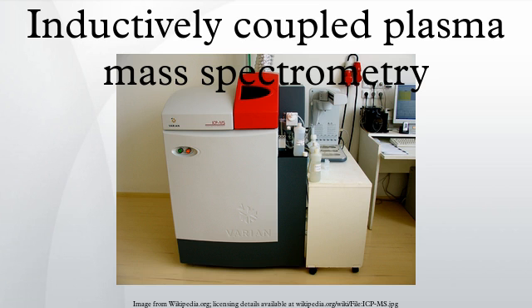Supplying the reactive collisional gas into the tip of the skimmer cone and/or into the tip of the sampler cone induces extra collisions and reactions that dissociate polyatomic ions in the passing plasma. Fundamentally, CRIs are mini collision reaction cells destroying ICP-MS interferences using a collisional kinetic energy discrimination phenomenon and chemical reactions with interfering ions, similarly to traditionally used larger collision cells.